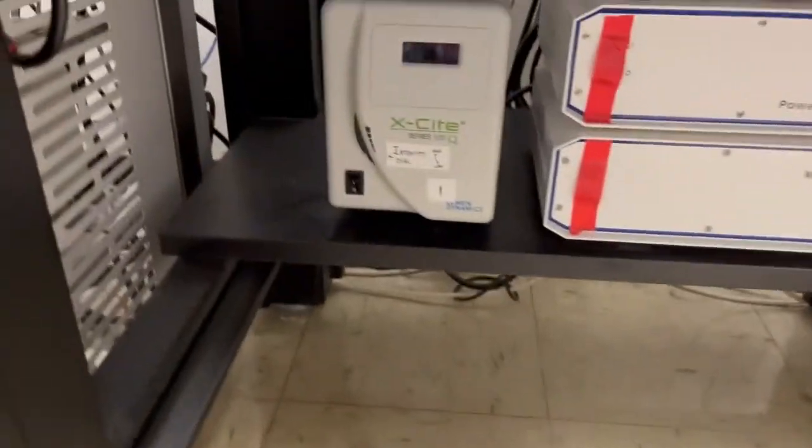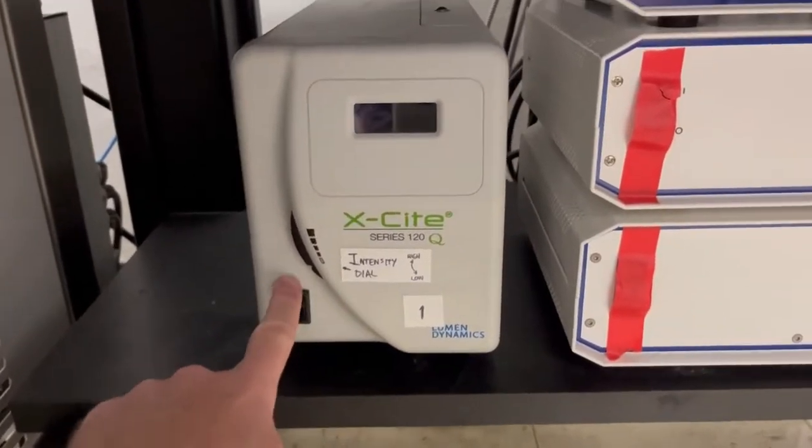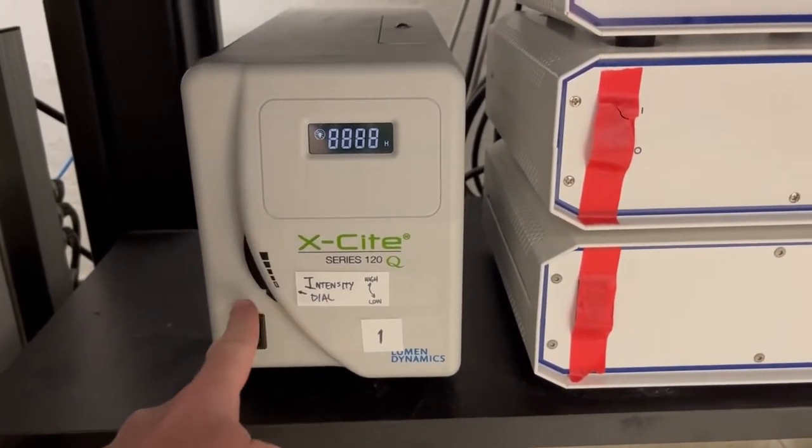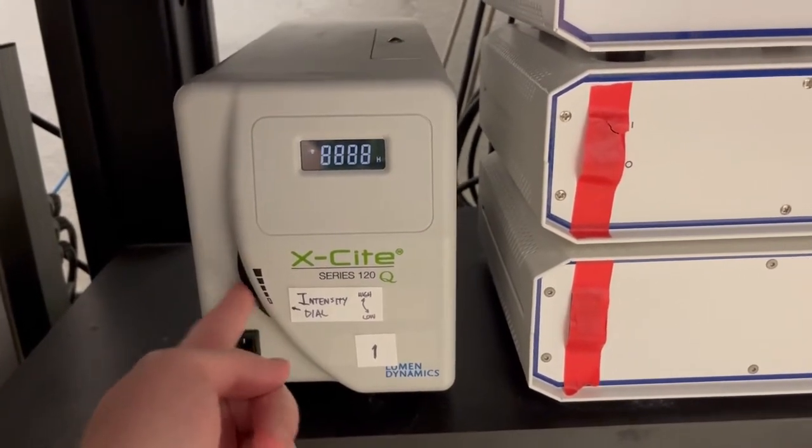That is under the desk, the table here. You're going to hit this switch and then increase this intensity dial — which you can see by the notches at the bottom — all the way to the top.